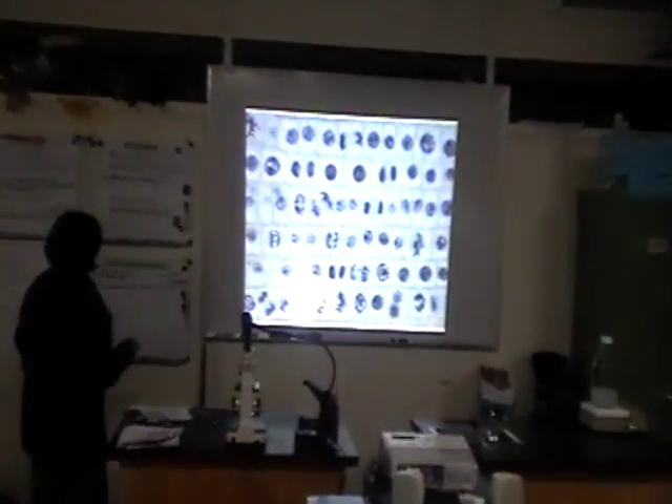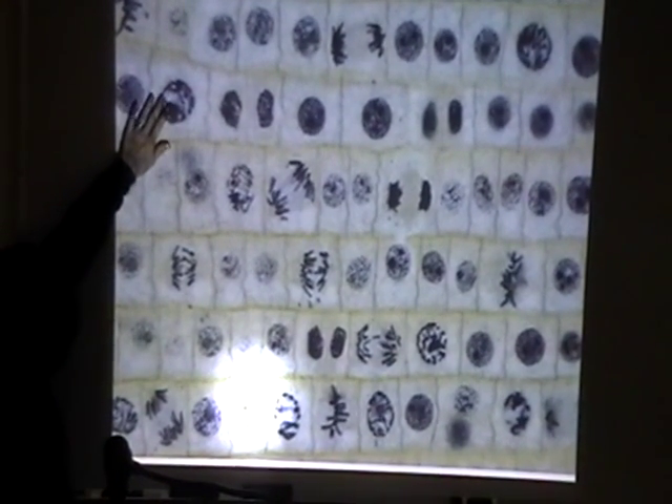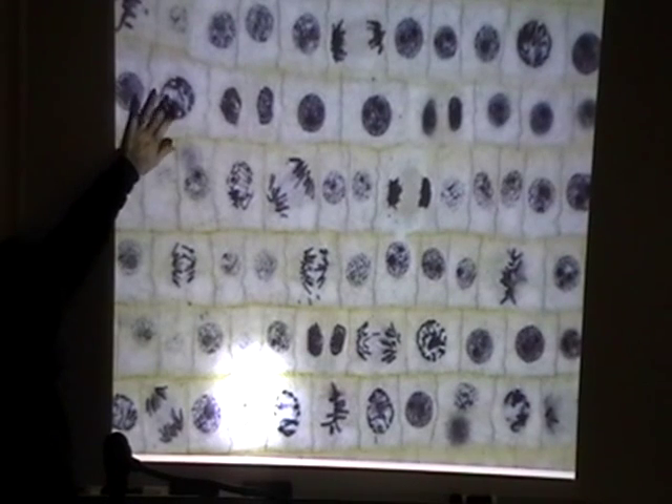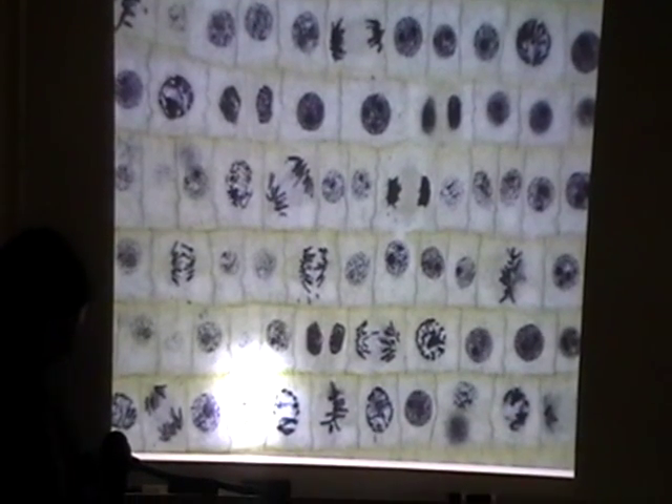So I step around and start to point out what we see. Here we have the prophase, and we can see that the chromosomes are starting to bundle up nice and tight.